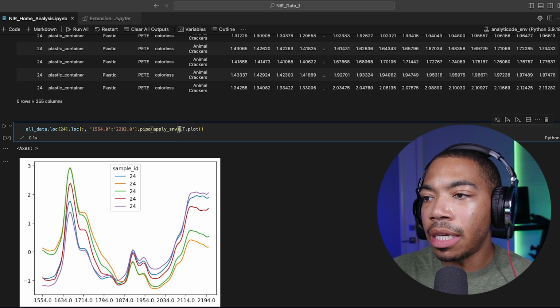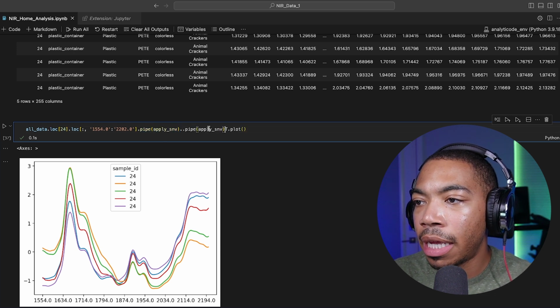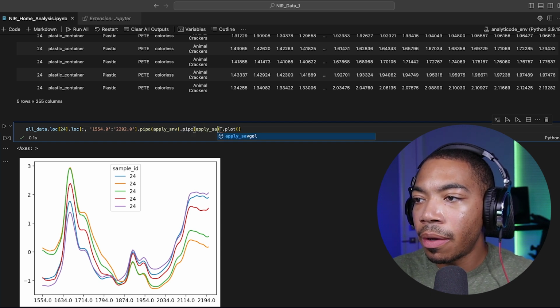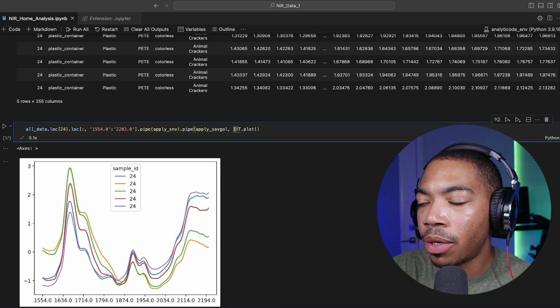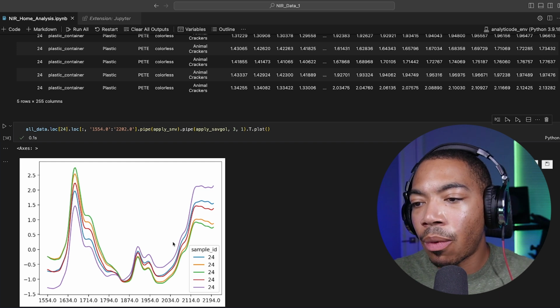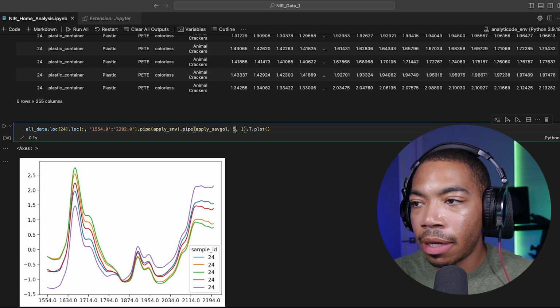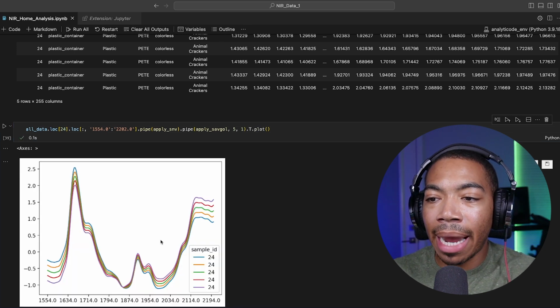We have other techniques that we could use. So not only standard normal variate, but in previous videos, we've also applied Savitzky-Golay, where let's just try a window length of 3 and a polynomial order of 1. And then let's transpose this again. And you can see how we're already cleaning up that signal. And we can even try a larger window. And you can see how we're really bringing that data back together.